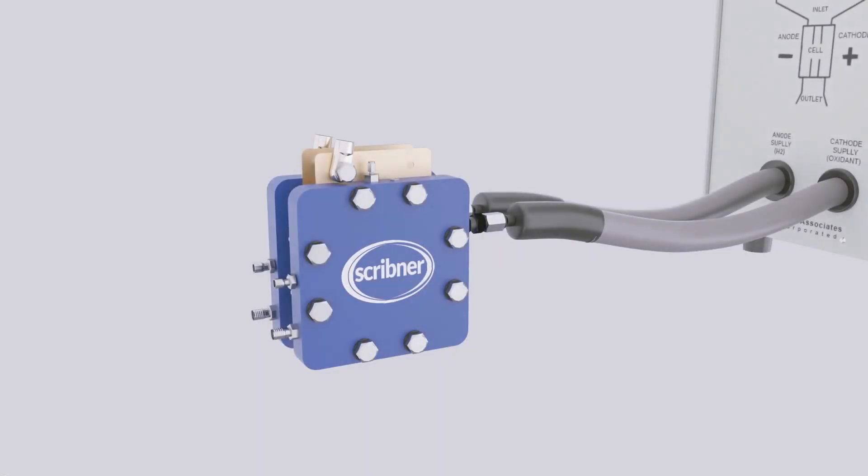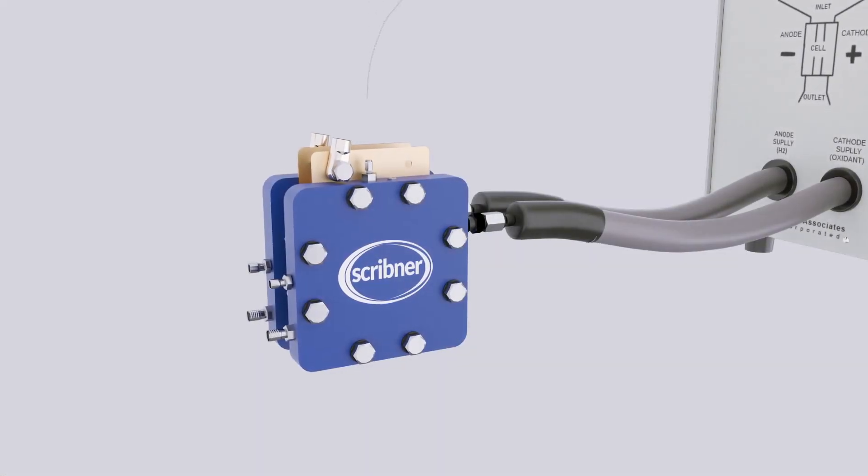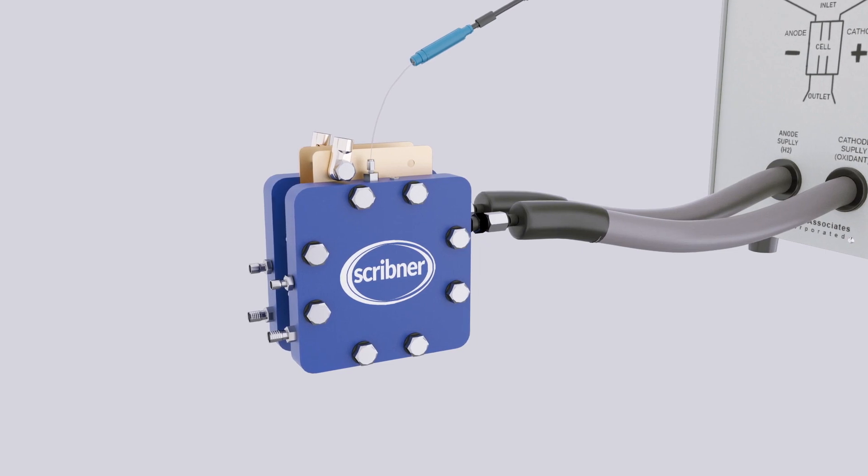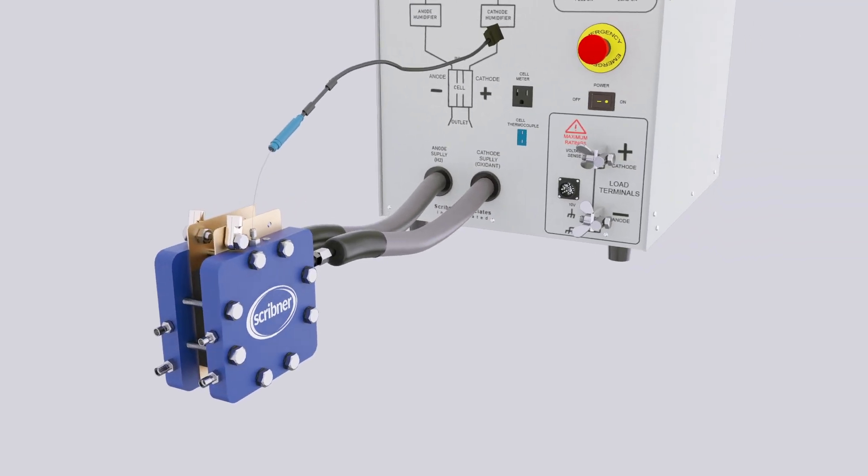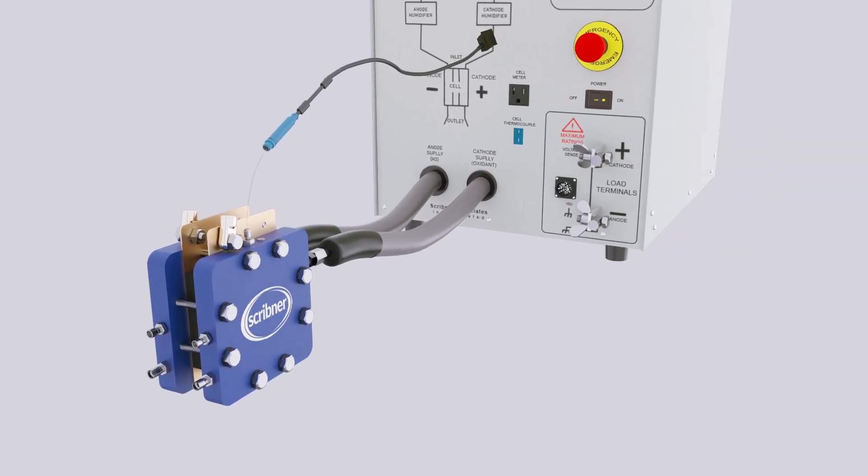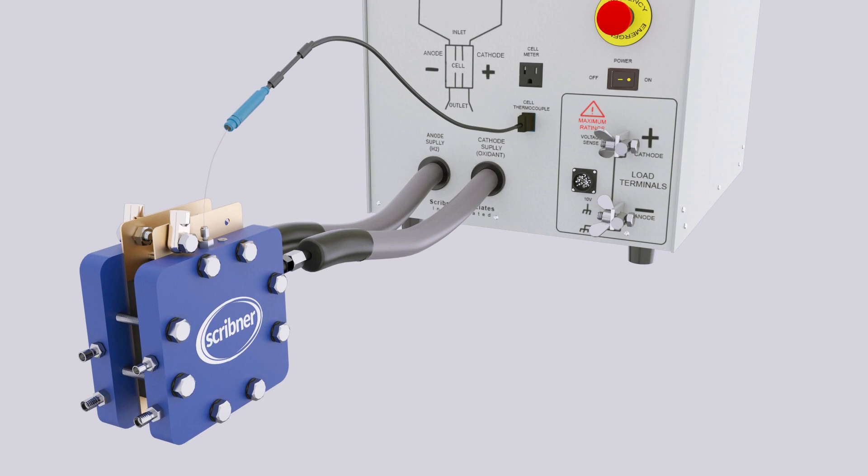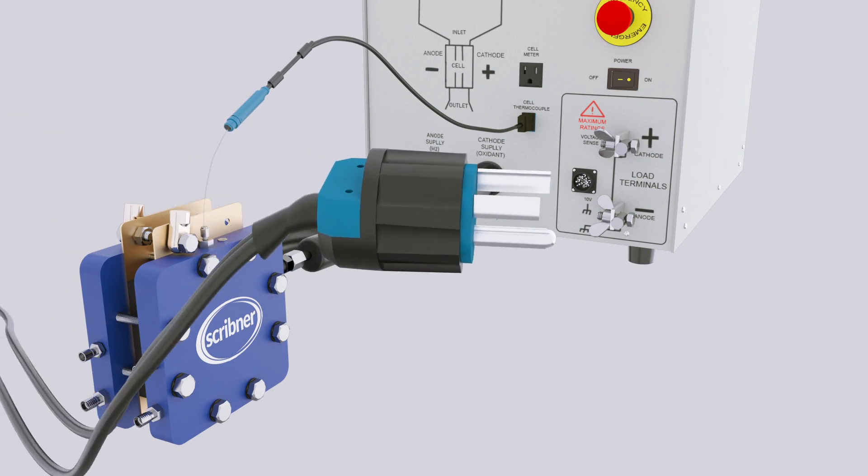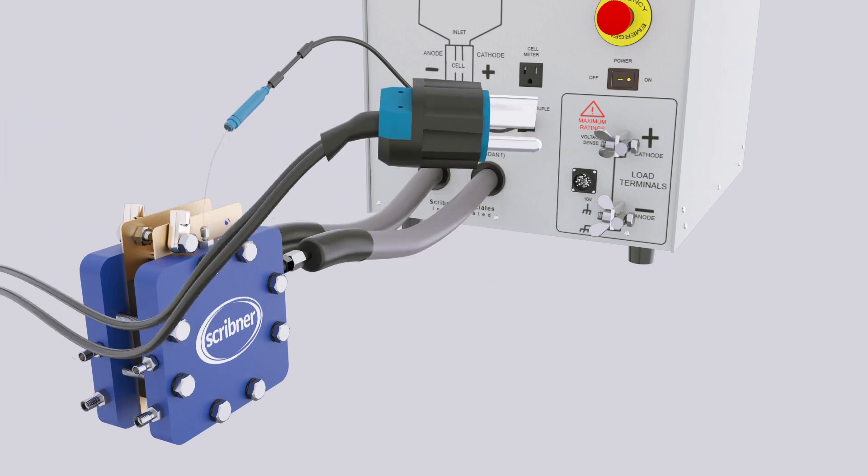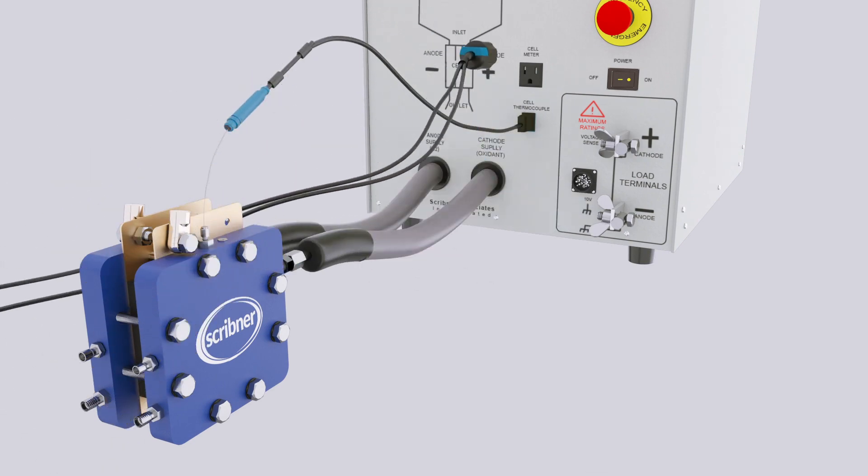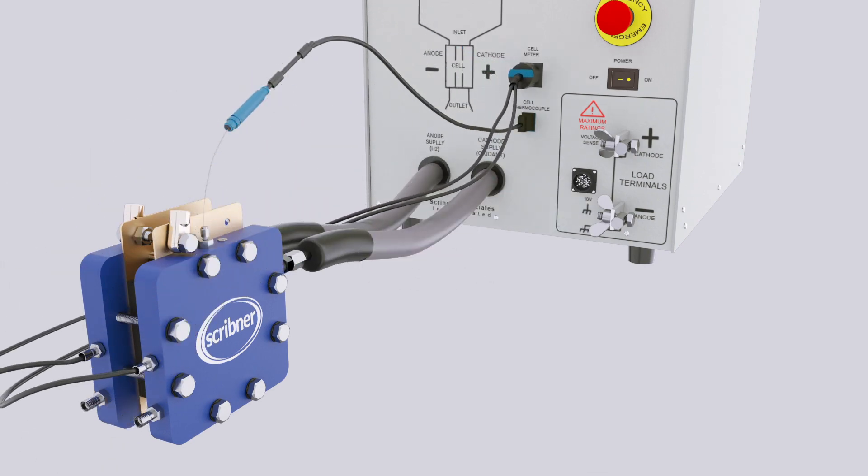Insert the thermocouple into the cell fixture. Connect the thermocouple plug to the thermocouple input on the 850 front panel. Connect the cell fixture heater plug to the cell heater power socket on the front panel of the 850.